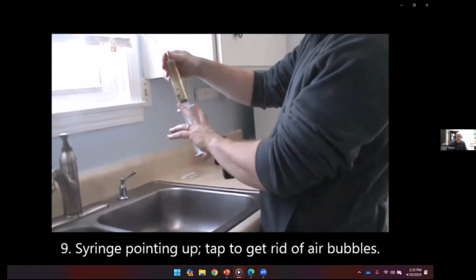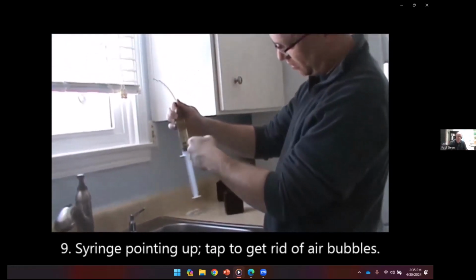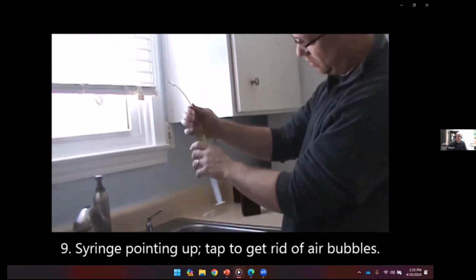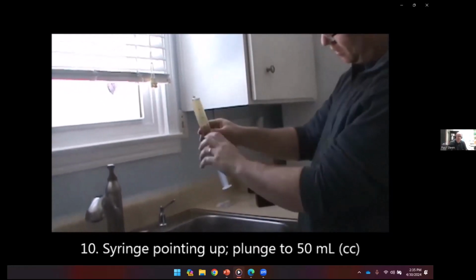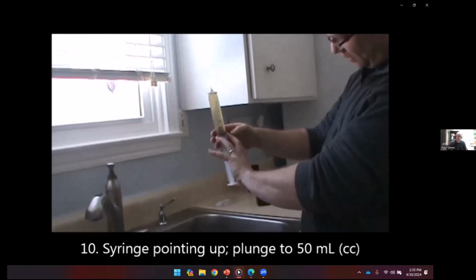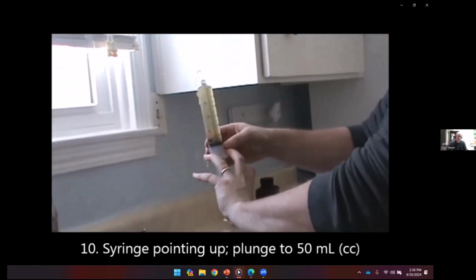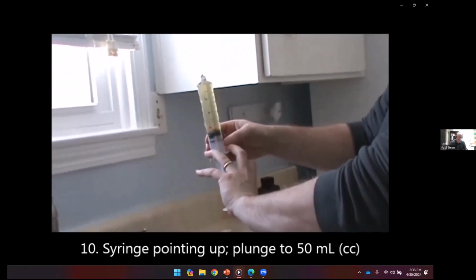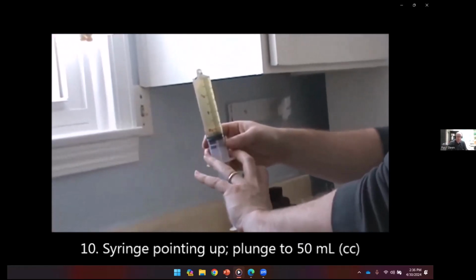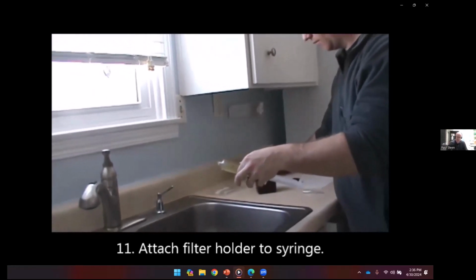With the syringe pointing up, tap it to force air bubbles to the top. Push the syringe plunger until the end of the plunger is lined up with the 50 milliliter mark. Attach the filter holder to the syringe.